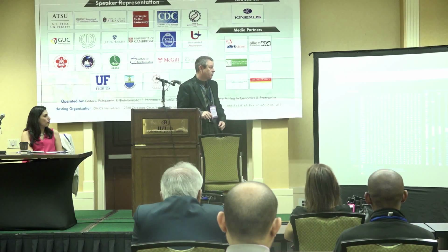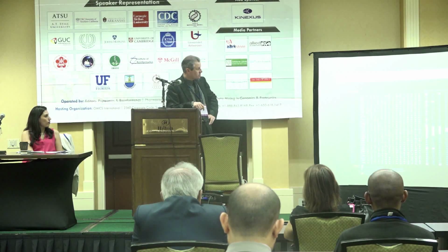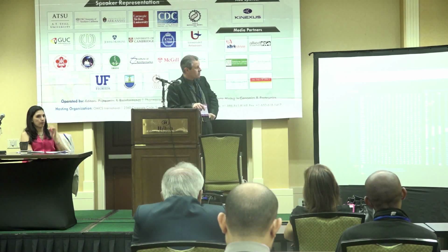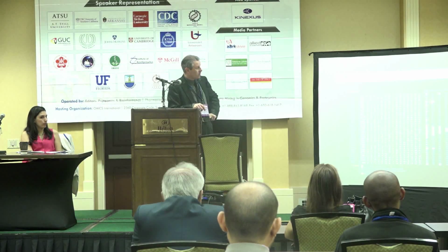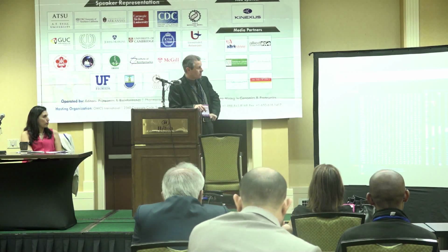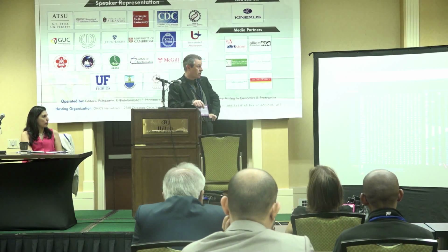Now, when you scroll down on the page, you'll get a listing of all the phosphorylation sites, the sequences, and then these navigation bars. If there is a white button, it means that if you take your mouse over it, you'll actually see information on what the effect of the phosphorylation is, or what kinases are known to phosphorylate the site, or phosphatases to dephosphorylate the site. Later we'll be having links to our products here.